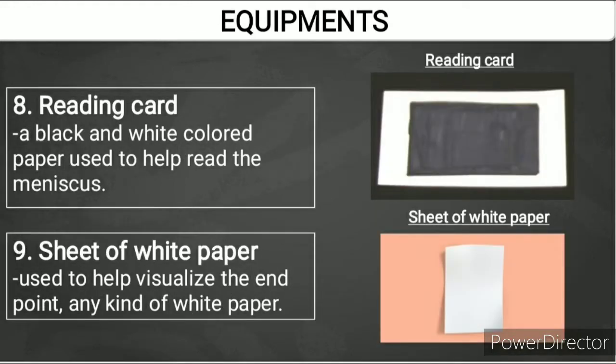Eighth equipment, reading card, a black and white colored paper used to help read the markings in the burette. Ninth equipment, the last equipment, sheet of white paper, any kind of white paper, used to help visualize the endpoint.